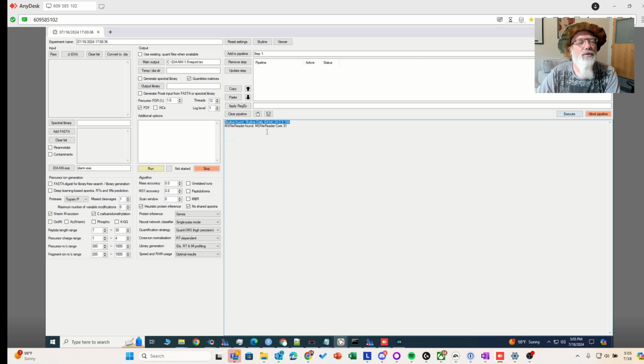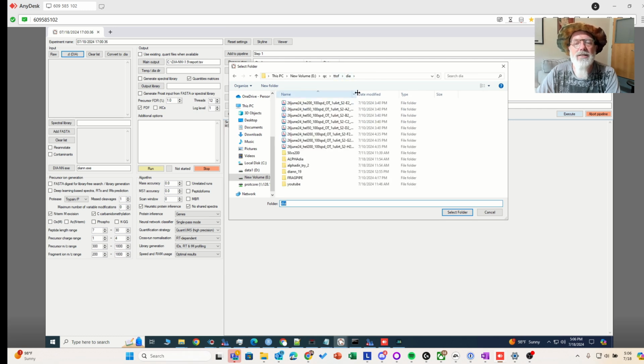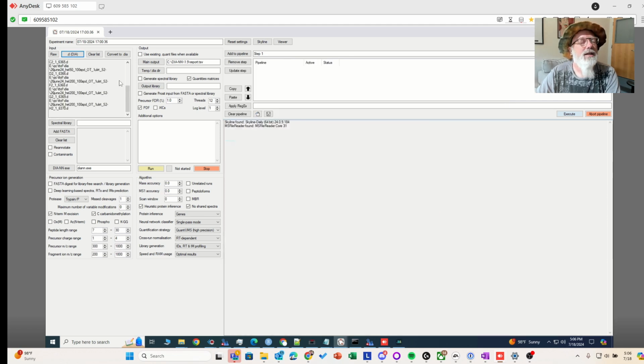Okay, so what we're going to do is drop in those .d files that I used in my last videos, the normalization video and the FragPipe video. I believe those are these files here. There should be eight of them: 1, 2, 3, 4, 5, 6, 7, 8. You load them by making sure you hit .d and not raw. Usually when people refer to raw, it's Thermo, but we're using Bruker, and that's a .d, and you know that because the files end in .d.